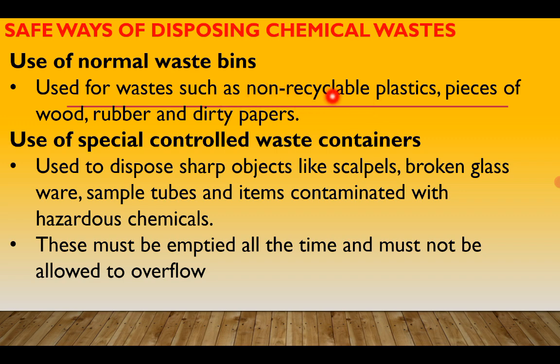When you generate such waste in the lab, all you have to do is collect it and simply throw it into the waste bins. Please take note which wastes can be disposed of using waste bins: non-recyclable plastics, pieces of wood, rubber, and dirty papers.